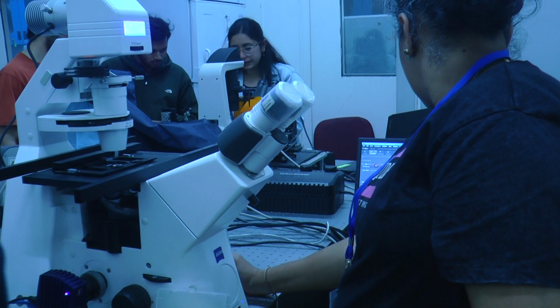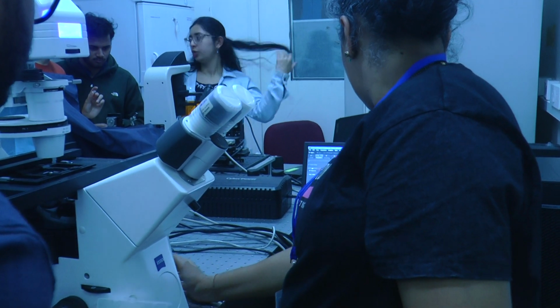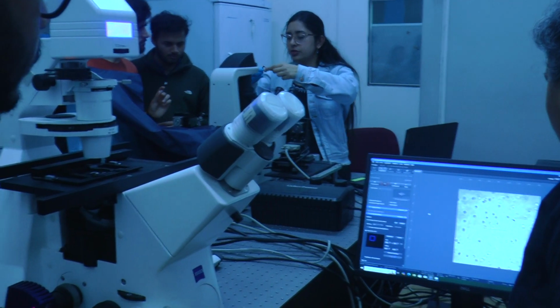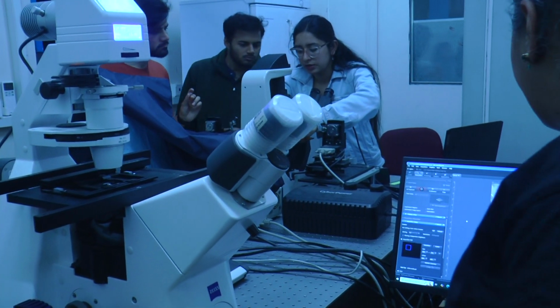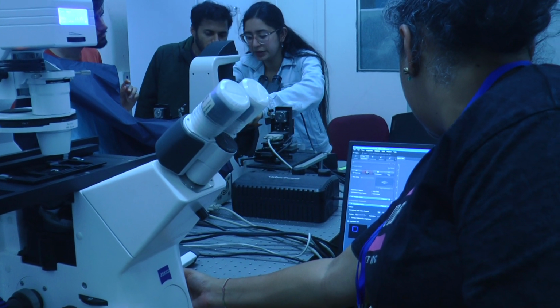Normally we look directly, and then there are a lot of inspections and all that. So these are the normal control. We have these spacers. You can see that they are in their discocyte shape and they retain their shape. See the sample in the middle of this spacer.